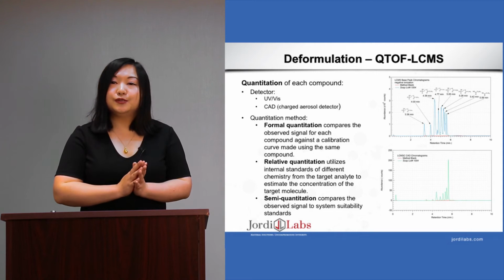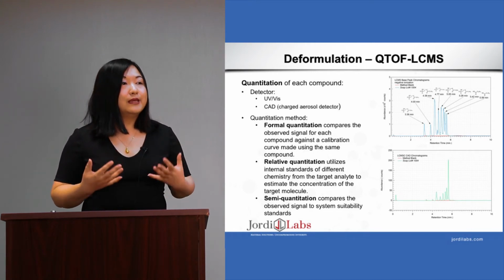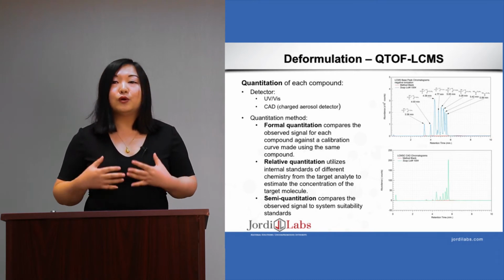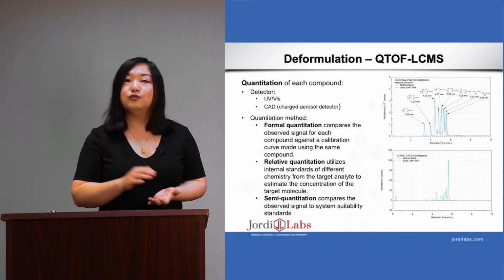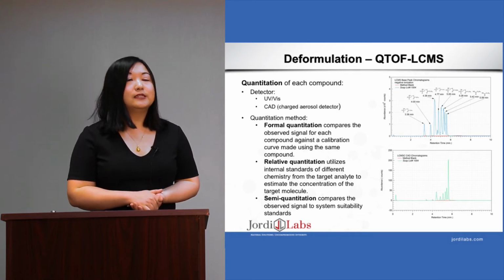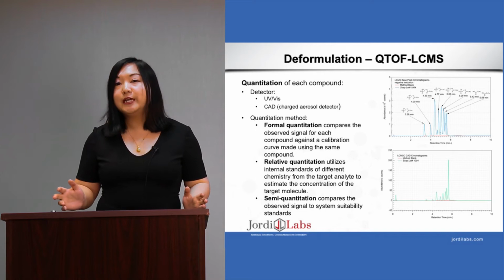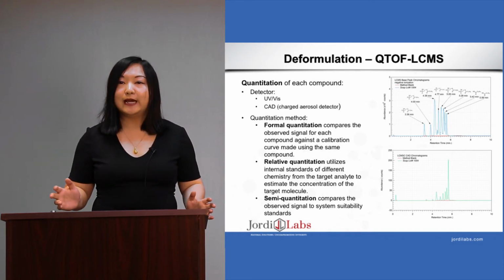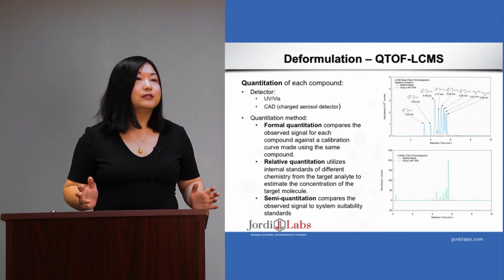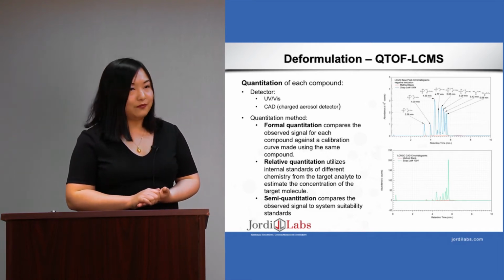After we used LC-MS to do the qualitative analysis, we then moved to the quantitative analysis. The detectors we use here at Jordi Labs include UV and CAD. UV is good for compounds which have chromophores, while CAD is a more general detector which can give you quantitation values on compounds which do not contain chromophores.